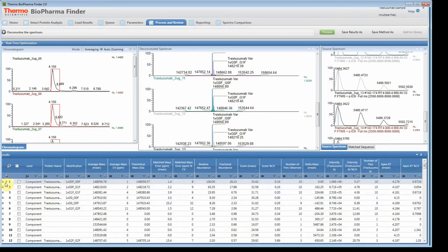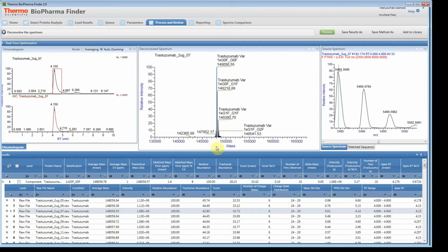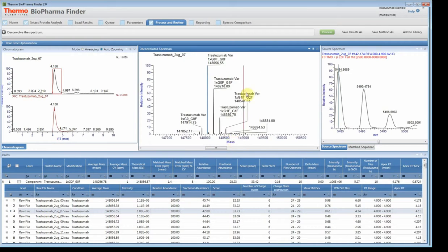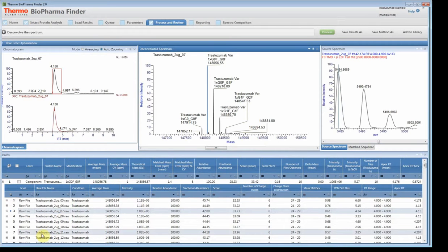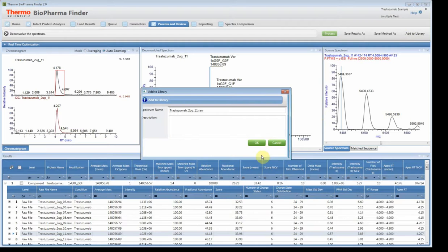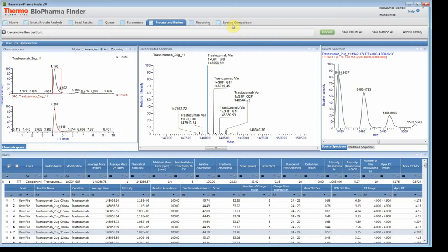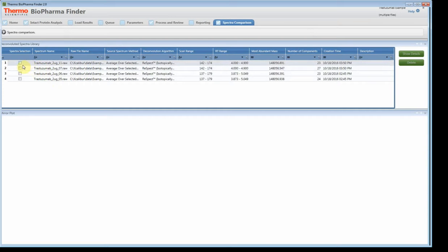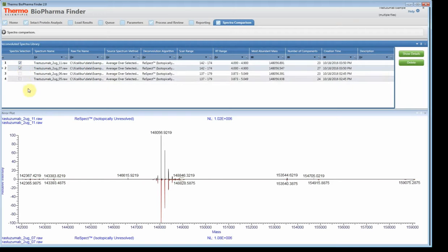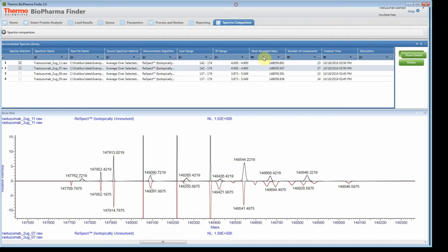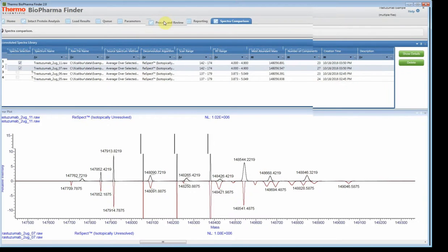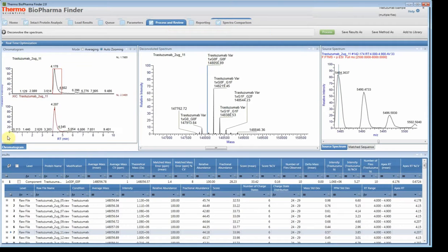I want to show one more thing: if you click on the deconvoluted spectrum and want to add it to the library — here's file 7 — you can hit OK. Then let's pick file 11 and add it to the library as well. Now if you go to spectral comparison, you can actually compare those files with mirror plots. You can zoom in and see how they differ from file to file. It will also show you the details — make sure when doing comparison that the data was processed using the same method, because parameters can really impact your results.